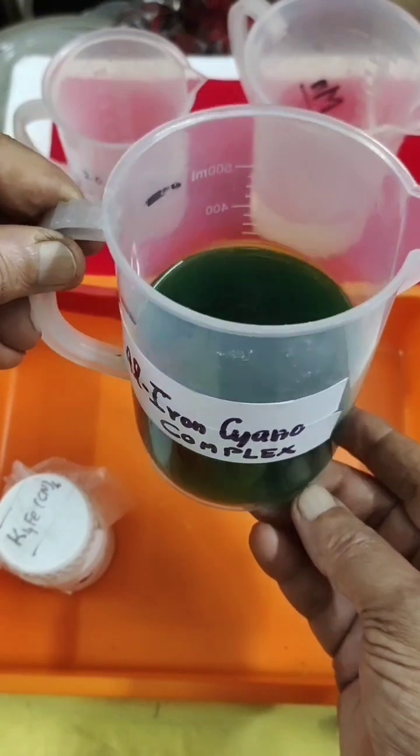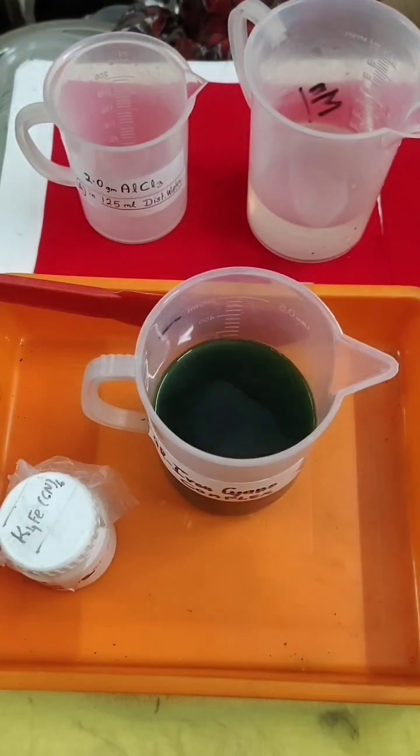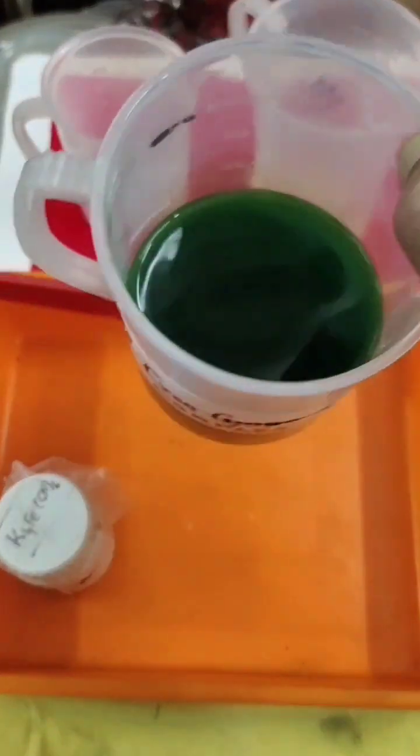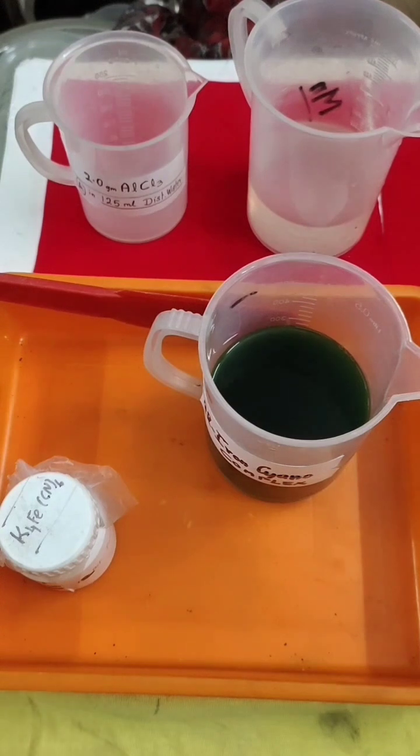This takes time to decant naturally. You have to keep it for two to four hours. Now you can see the sediments will settle down — those complex particles will settle down. The upper clear liquid we can throw out. A second time you can add about 100 ml of distilled water to the solid, and again keep it aside for two to four hours.